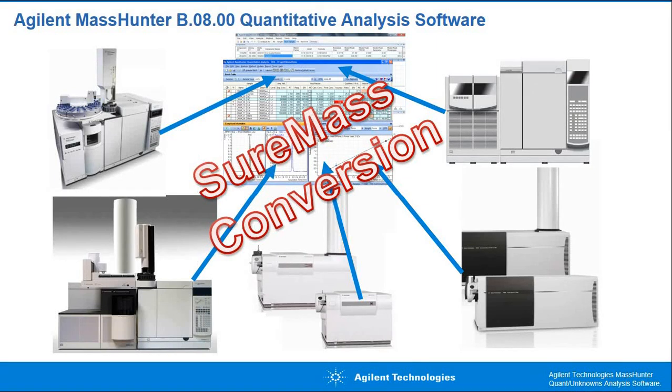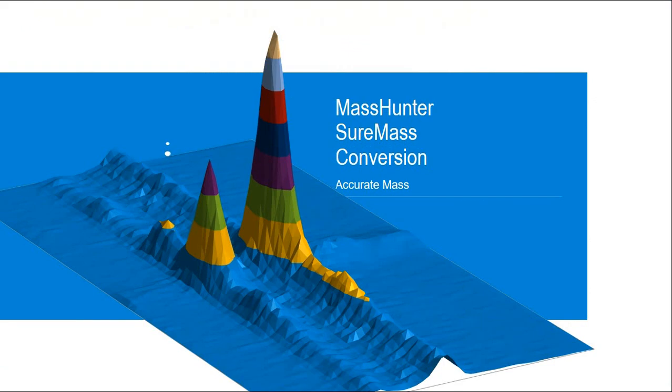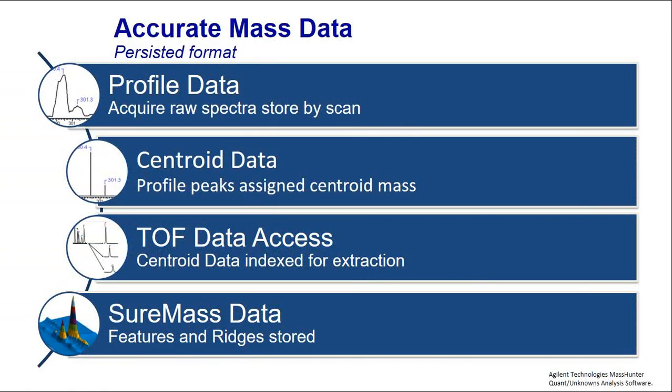Welcome to a discussion of SureMass conversion. We will cover SureMass and its features, as well as the TOF data access layer and the raw profile data. Let's take a look at accurate mass data, the persisted format, and the different choices. Each has its strength and weakness.